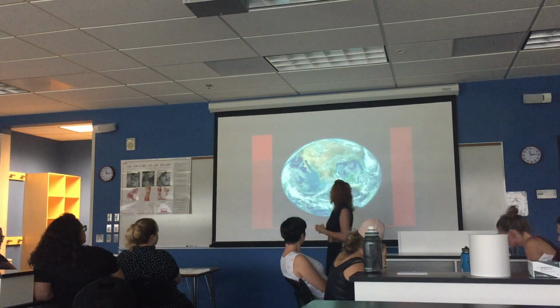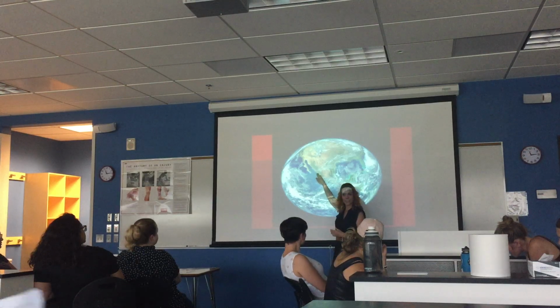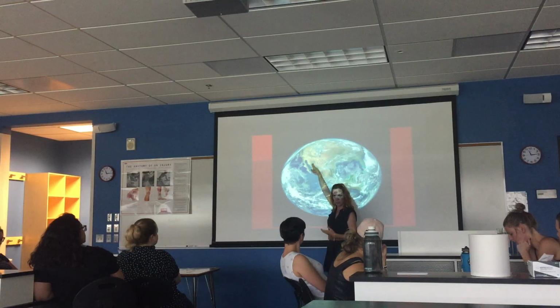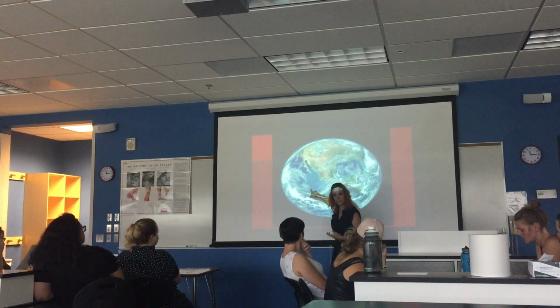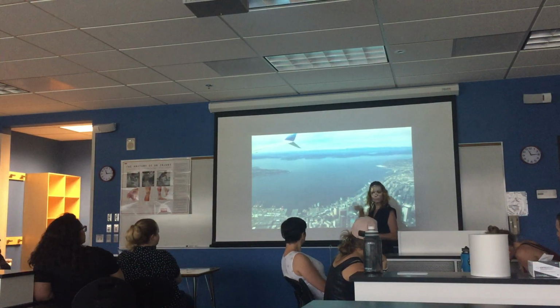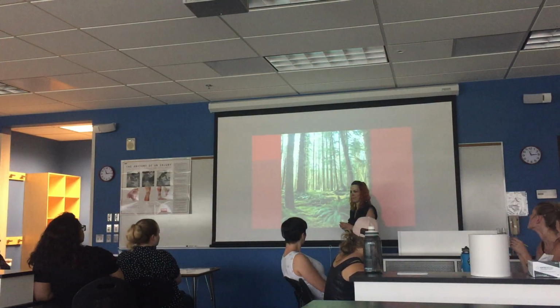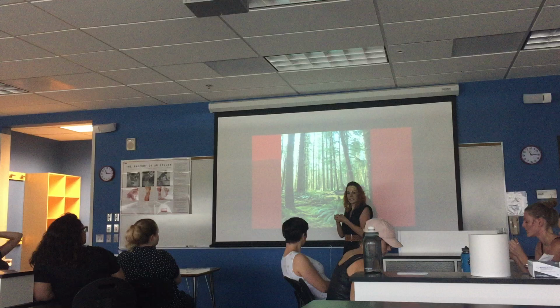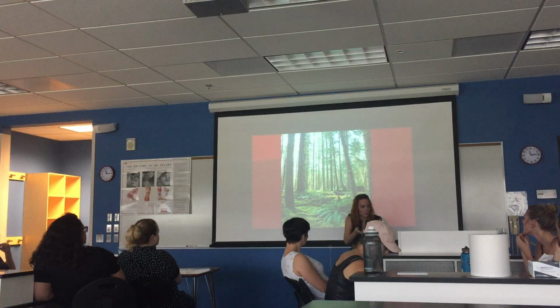I'm going to be like, okay, well, back it up. If you're looking for the edge, go over here where there's an edge. Or if you're looking for a tree, go over here where it's green and forest-like possibly. Or if you're looking for a dolphin, don't be over here, look over here. So then you go to 10x and you're like, oh, fishes are going to be here, buildings are going to be here, and then you zoom in and you find your phone. Often, a lot of students get lost looking for things, and all they need to do is change their perspective, back up again and go back down again.